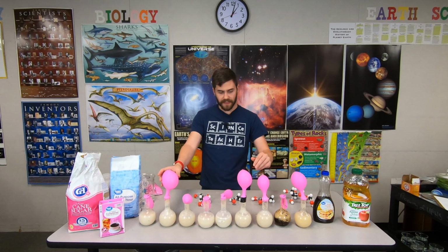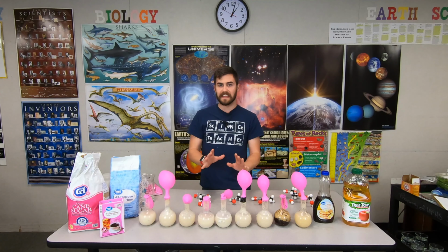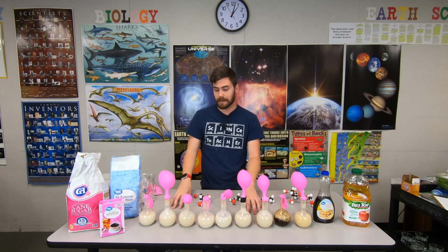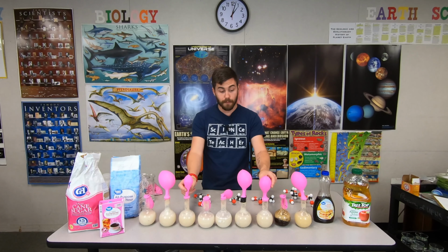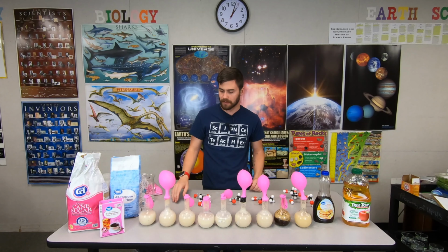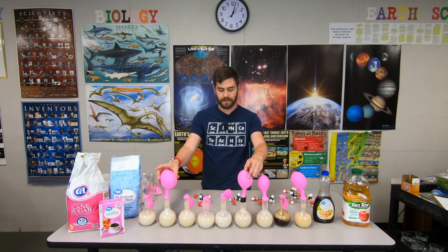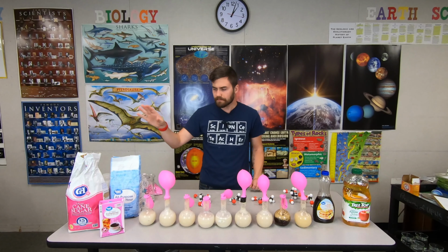So, one other thing that I would like to talk about, why is this balloon larger than this balloon? Now, I think eventually both of these balloons would inflate to approximately the same size. And I think over a very long period of time, the balloons with more carbohydrate in them would get bigger than these two. They would just have to sit here for a long time. I believe that the balloon on the sugar is larger than the balloon with the flour, because put sugar in your mouth, and what happens?